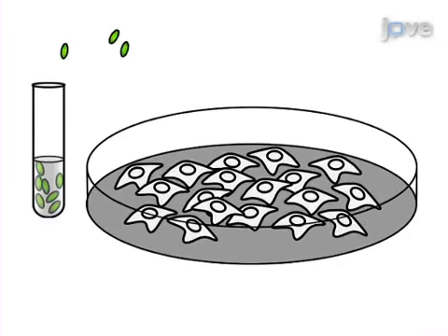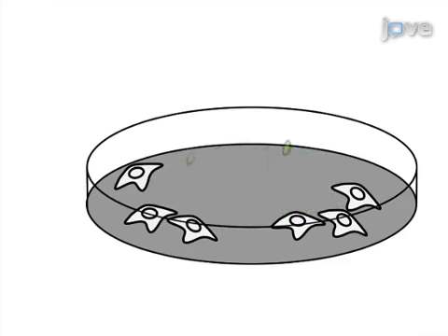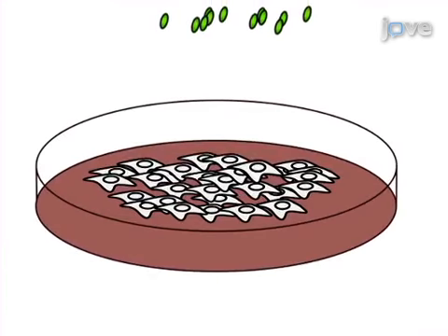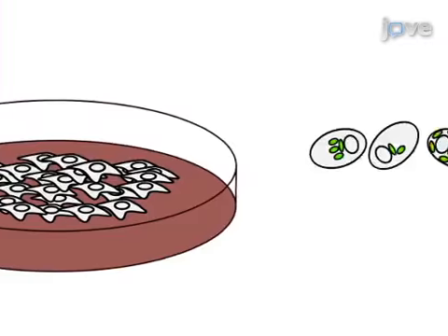Here, Legionella pneumophila expressing GFP are used to infect the natural host protozoan Acanthamoeba castellanii monolayers. The L. pneumophila are then harvested by selective lysis, and the concentration of bacteria is then calculated using a formula based on fluorescence emission. Dilutions of protozoan-primed bacteria are then used to infect mammalian cell monolayers.